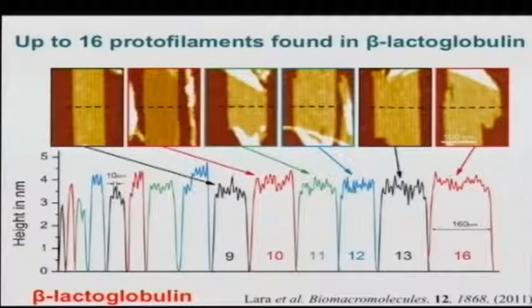A helical ribbon has a high mean curvature, so you can smash it down to the substrate, but it has no Gaussian curvature, so it has no twisting. That's why you can resolve the individual filament much better.